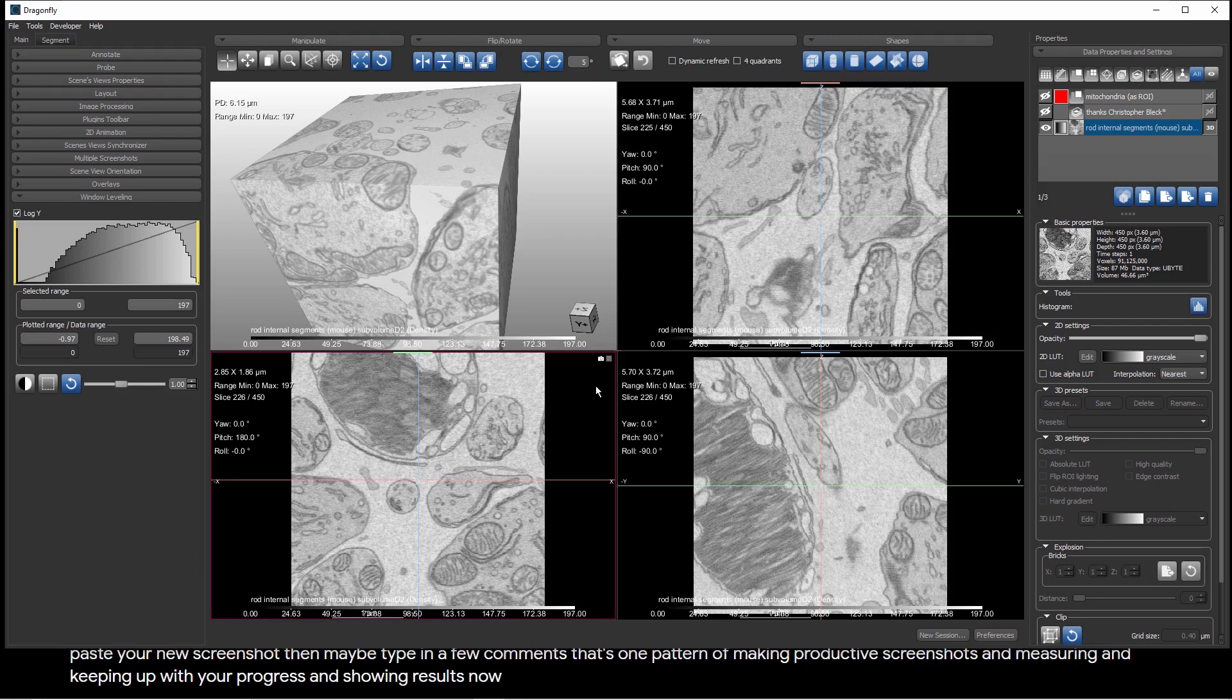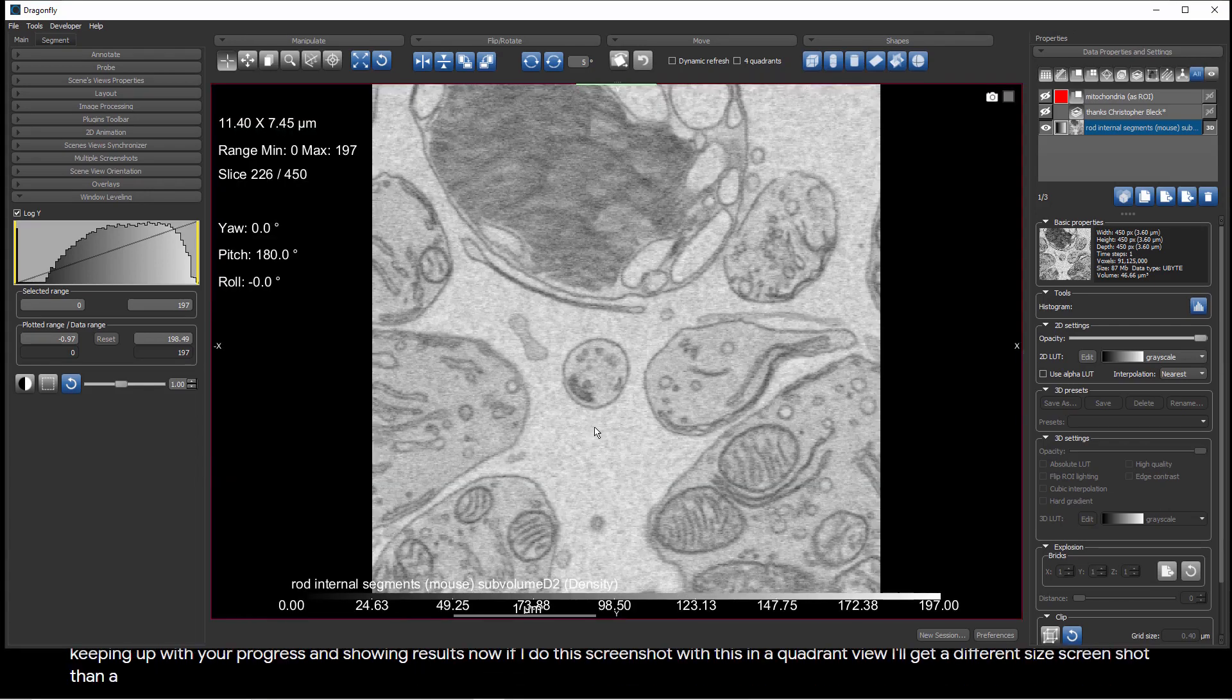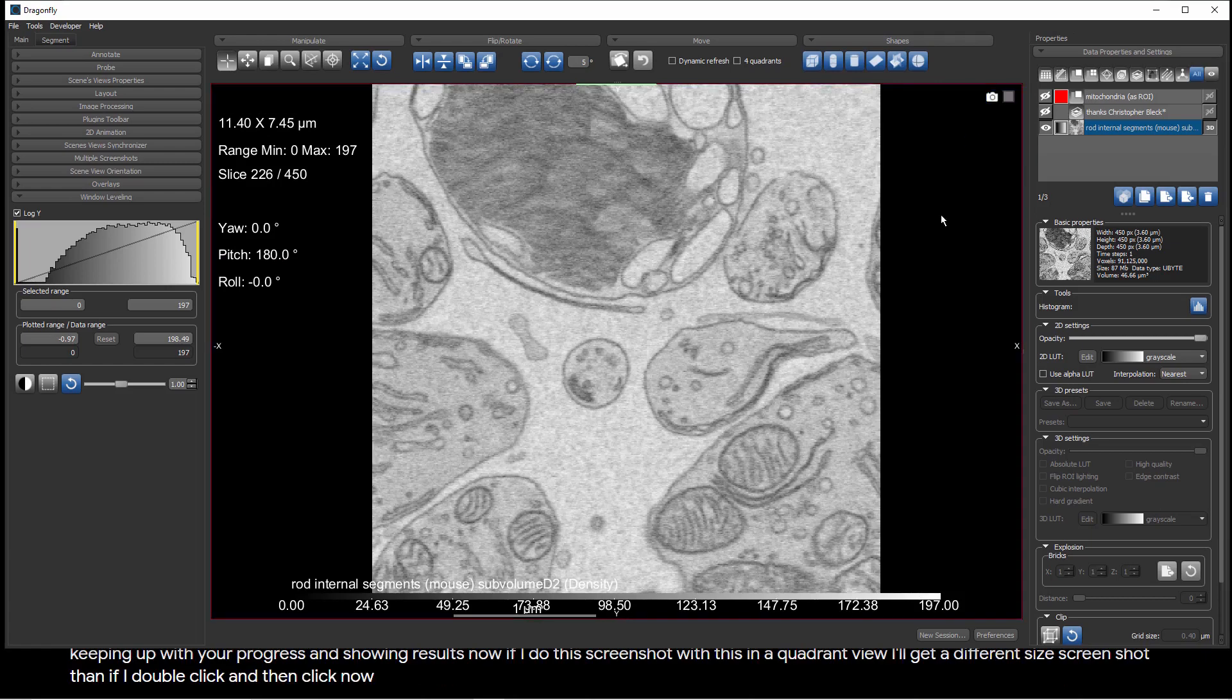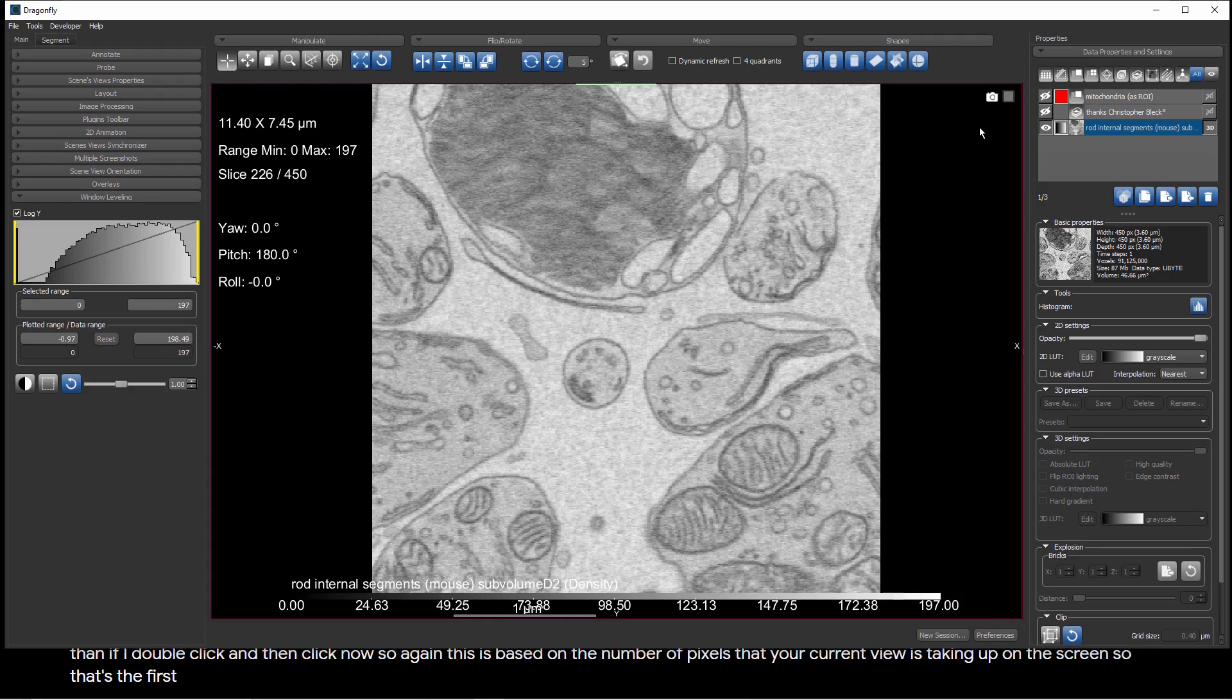If I do this screenshot with this in a quadrant view, I'll get a different size screenshot than if I double-click and then click now. This is based on the number of pixels that your current view is taking up on the screen. That's the first mode, simply clicking the camera to get a screenshot.